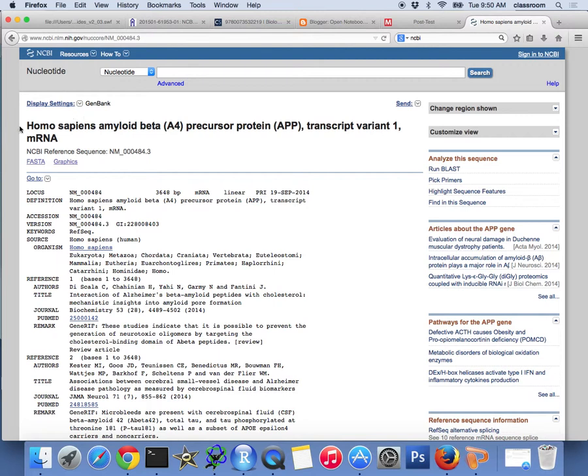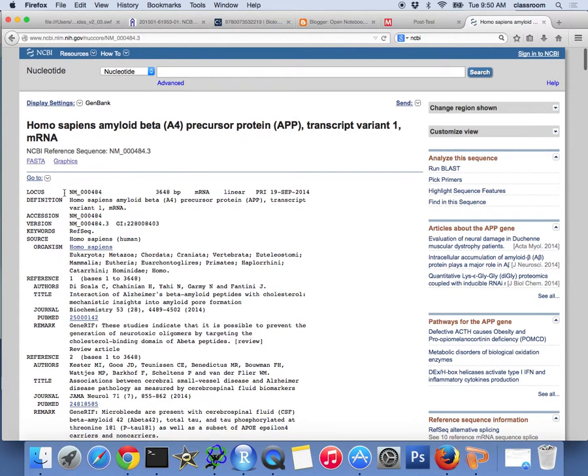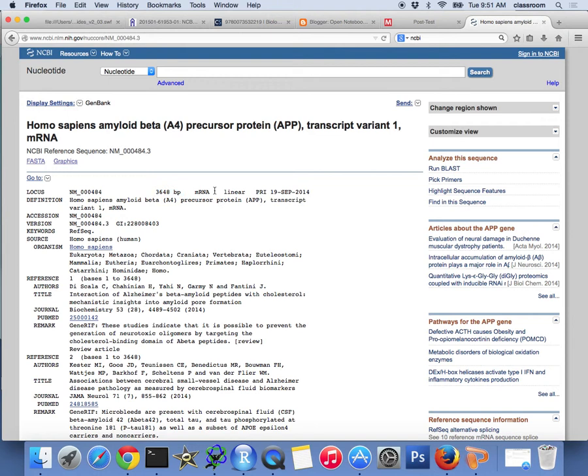So this is basically Homo sapiens amyloid beta precursor protein transcript variant 1, mRNA. So this is the amyloid beta precursor protein. So it actually shows the locus. That's your access. So what is a dot 3? Dot 3 means version 3. If you see a gene set dot 1, that means version 1. Dot 3 means this is the third version of this gene. So this one has, how long is this one? 3648 base pair. This is the mRNA. It's linear. And it seems to be last updated in September 19, 2014.